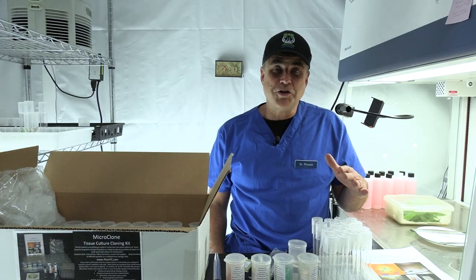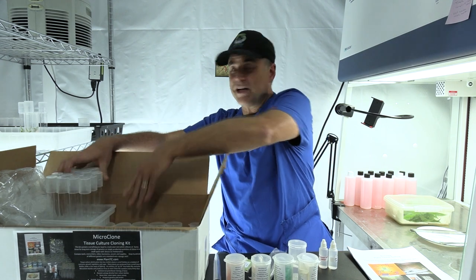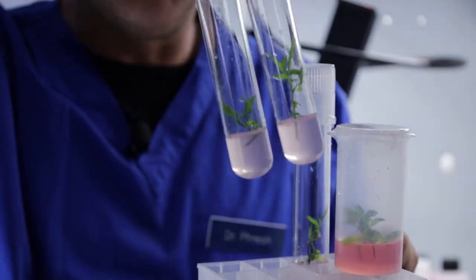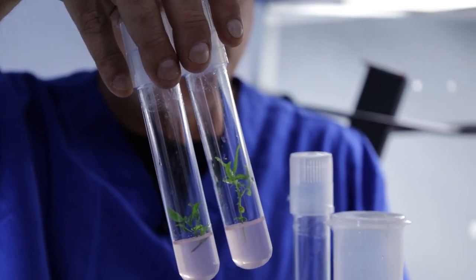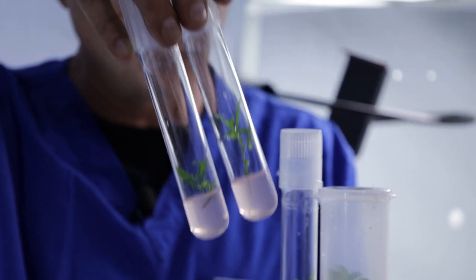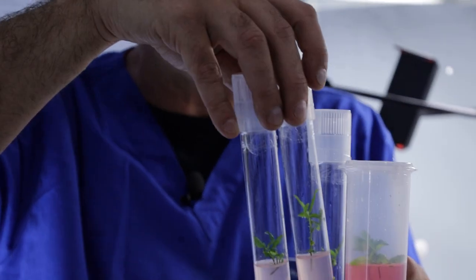I wanted to introduce you to the plants that are in the actual tissue culture containers — this is what you're trying to grow. These are plants that were made by growing them on the multiplication medium first until they branched out, then moved over to the red rooting medium. These will root in just a few weeks and we'll take them out to plant them.